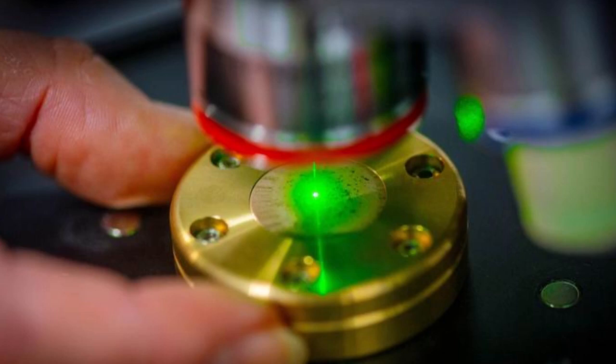River water, for example, contains massive amounts of suspended solids and fine sand, with plastic accounting for less than 1% of the particles. These particles must first be isolated before their concentrations and ultimately their chemical composition are determined. Previous methods have relied on the analysis of the residues that are released when the samples are heated. With that approach, however, it is not possible to determine the number, size, and shape of the plastic particles.